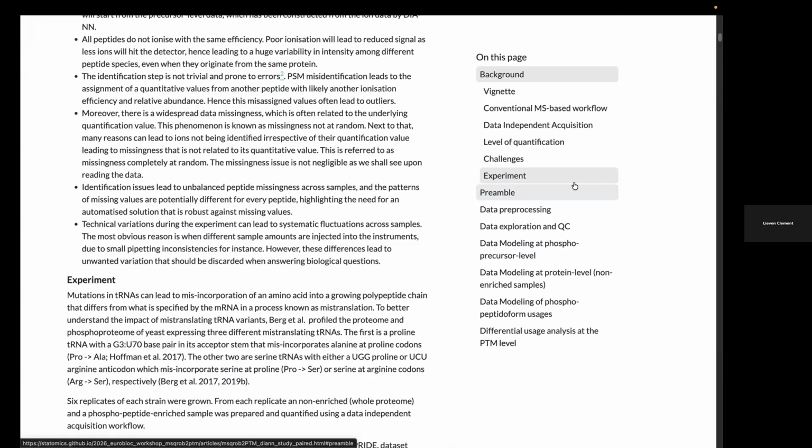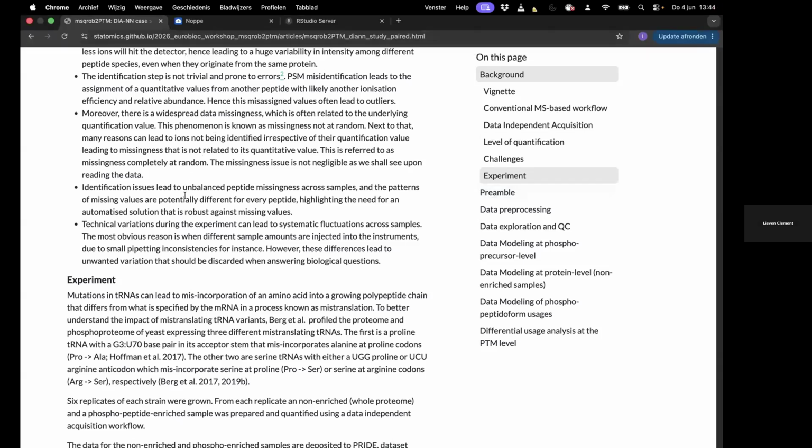A few features like delayed loading. I don't think you can use delayed information, so we have to get it in the data, we have to get it in the system anyway for the downstream analysis. But that would be a cool thing that we could have in the future, to work with single cell experiments, because then the memory usage would be much better.